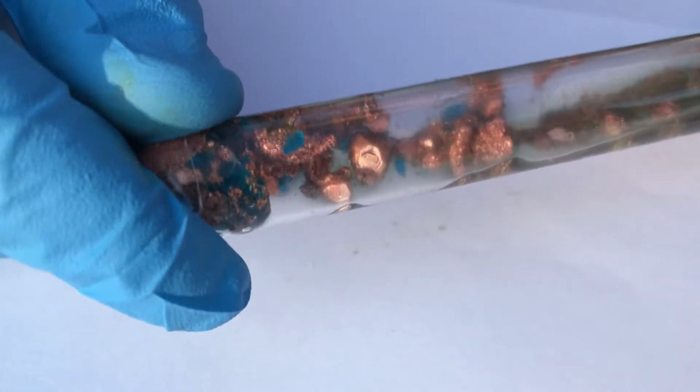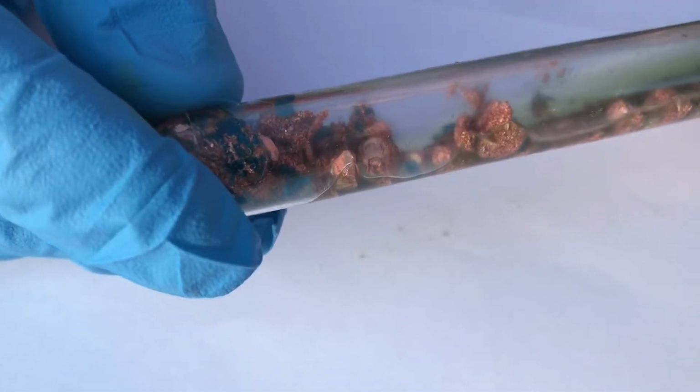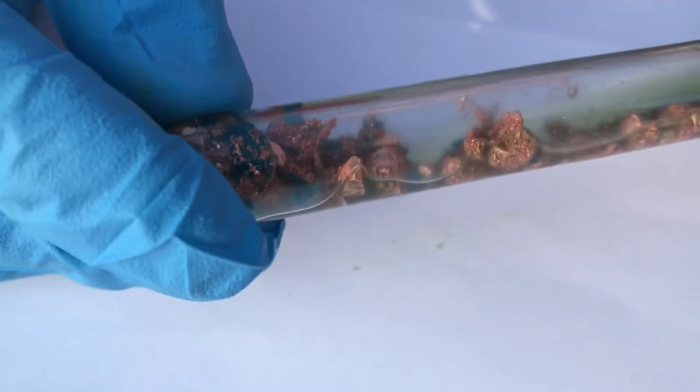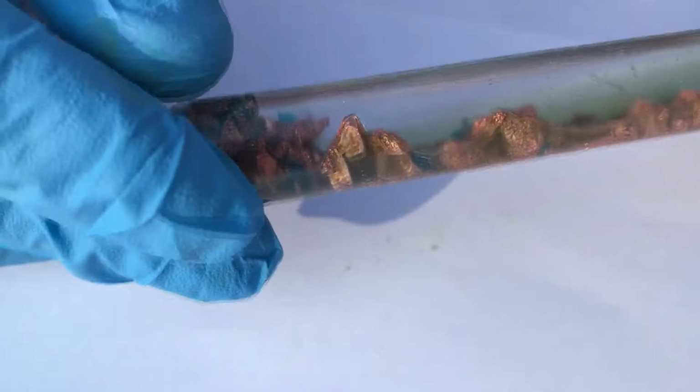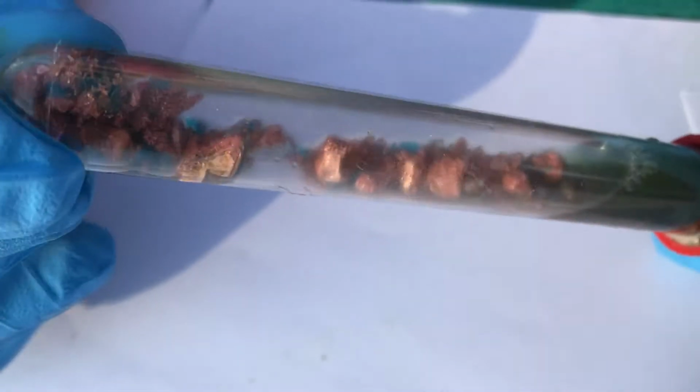They are quite reactive with the air moisture and the oxygen gas, so I keep them in sulfuric acid. That prevents the formation of copper(II) oxide. You can probably see that there is something besides the copper metal, something blue. Well, that is copper sulfate.